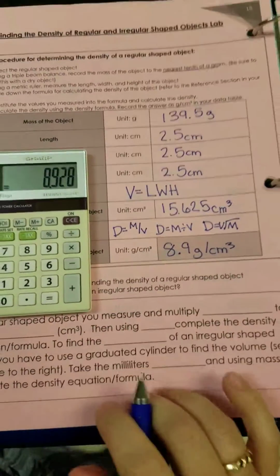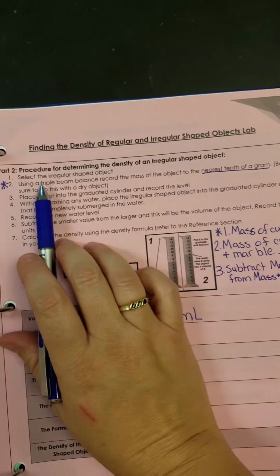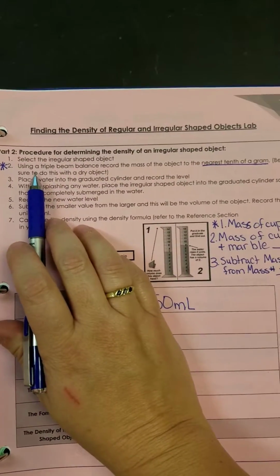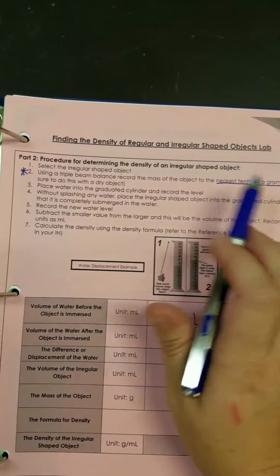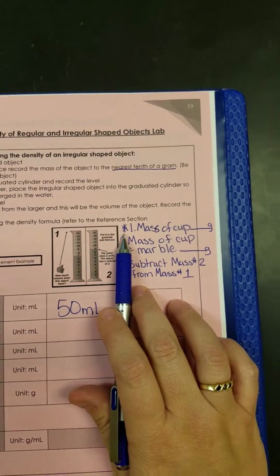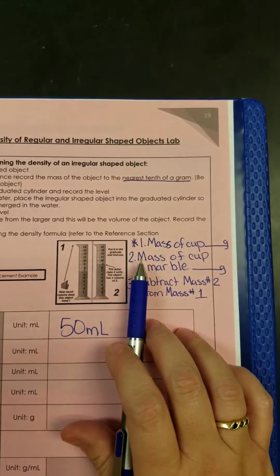Now let's skip this part and go to the next part for our irregular object. The irregular object is going to be a marble, not a rock, because we had problems with the rocks last time. We're going to use a triple beam balance to record the mass to the nearest tenth of a gram. But look, there's a star there. So go to the star. Because a marble would roll off the triple beam balance, we got to do something different.